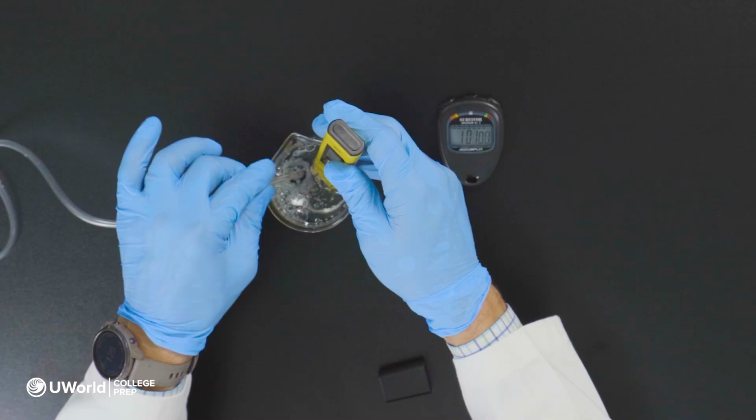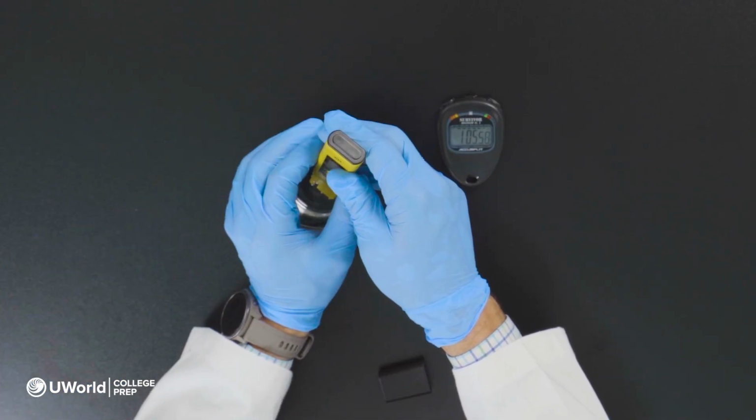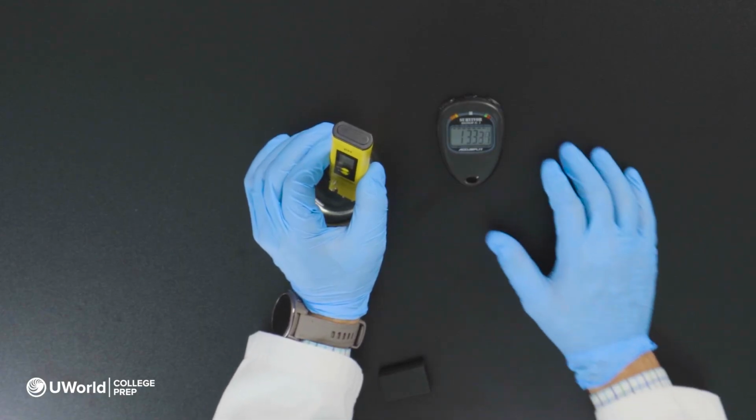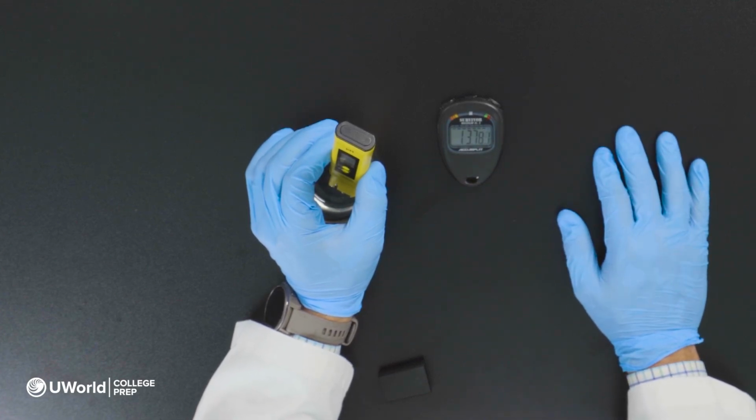So we're just about at a minute. We'll go ahead and pull our air stone out, and we'll continue measuring the pH of that. So at about a minute 30, we'll take another reading. I just took it. It's still around 7.